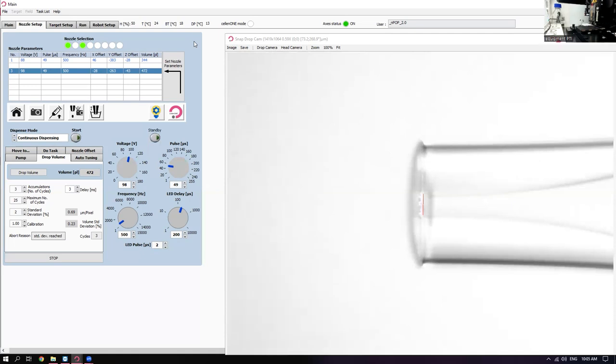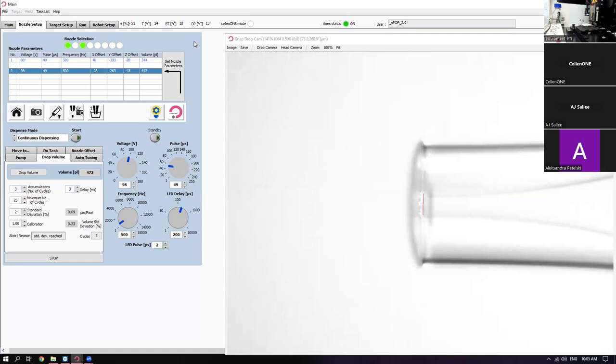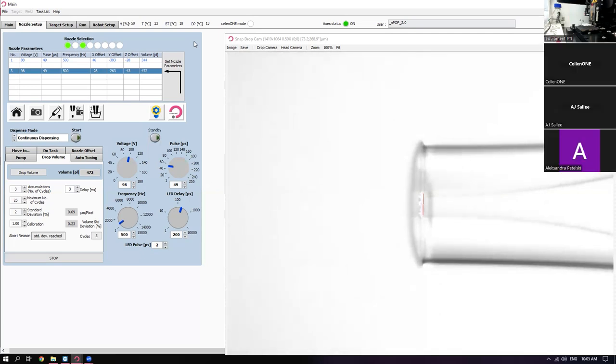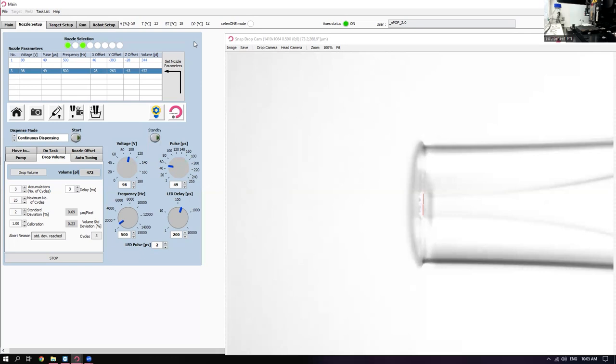Coming from the world of diagnostics manufacturing, clients would come to us with all different formats of diagnostic sensors, with semiconductor-integrated fluorescence detection on little 50 micron pixels, where we would have to put a drop of some capture probe. But everyone had their own format. That forced us to make this super flexible interface, which also makes it a little bit complex, which I'm sure a lot of you are familiar with from mass specs and other instruments.